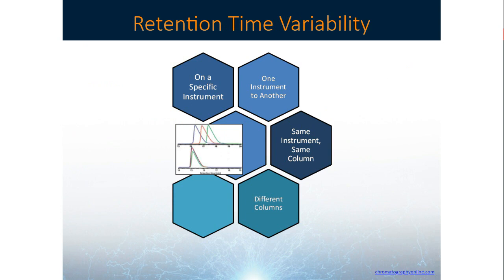Then we'll transition to retention time variability. A lot of different types, whether it's on a specific instrument, one instrument to another, same instrument, same column, or even retention time variability between two different columns. We'll cover all of these.